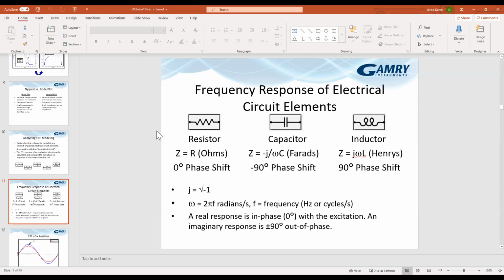So it really depends on what type of inhibitor you have and the nature of that inhibition and what potential you're measuring at. You tend to do EIS around the open circuit potential for corrosion experiments. Actually, most EIS experiments are done around the open circuit. So you've got the cathodic inhibiting half of that, but not the other half. The anodic is doing the same thing, and so it shifts the open circuit potential.